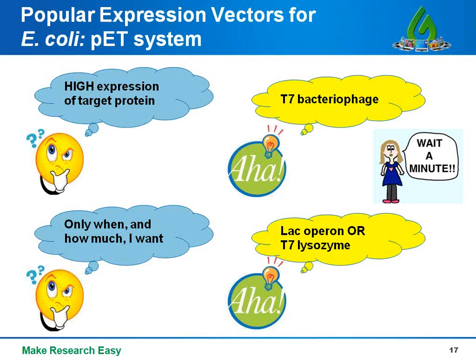So you can imagine there are several different systems that have been set up to provide regulatory checks on T7-driven expression. The basic foundational idea here is that you want an expression vector that keeps your gene transcriptionally silent until you choose to induce expression. That's especially important if your target protein could be toxic to the cell. As we mentioned before, toxicity can occur when T7-driven expression might overwhelm the cell's metabolic capacity. But also, some proteins can be toxic even at low concentrations due to the protein's biological effects within the cell.